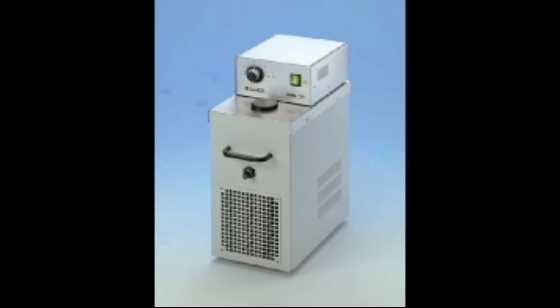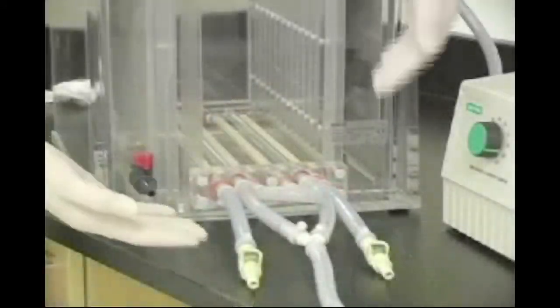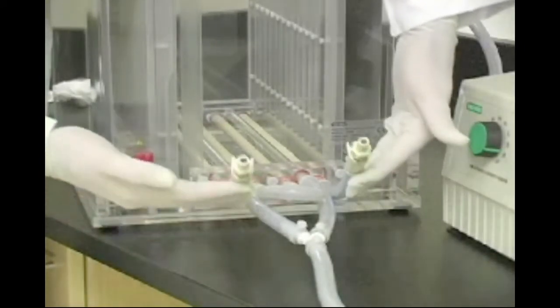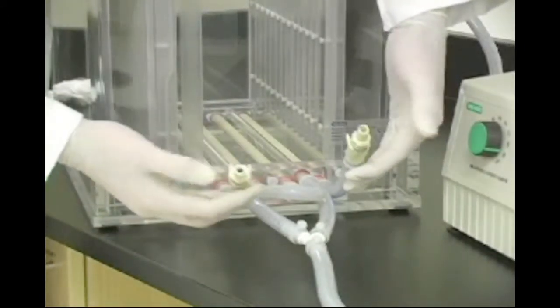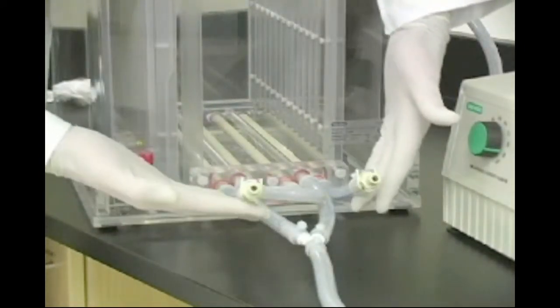A refrigerated circulator is required for optimal results and works in conjunction with the buffer recirculation system to provide efficient cooling. The Protean Plus DodecaCell has a built-in ceramic cooling core that must be connected to a refrigerated circulator that can maintain the buffer temperature at 18 to 20 degrees Celsius during electrophoresis. Three-eighths of an inch ID tubing can be connected from these fittings to the inlet and outlet on the circulator.